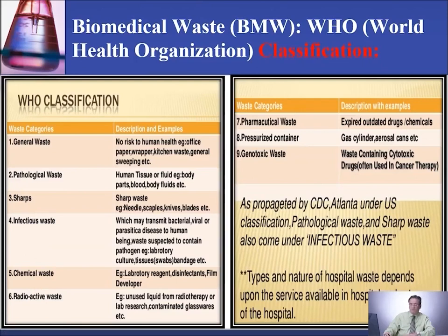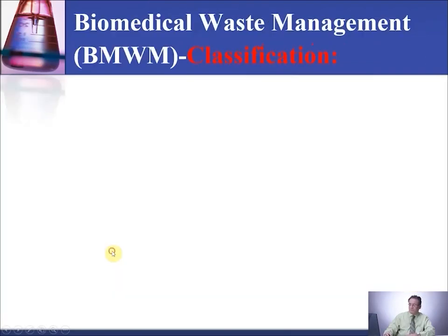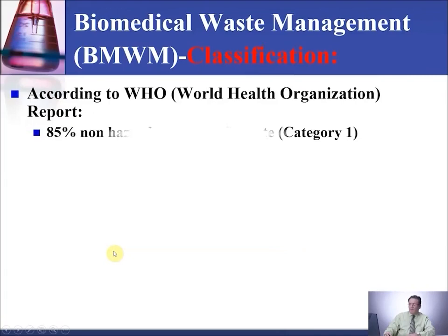You can go back to that or refer to that. Or you're going to end up with biomedical waste under number 2, number 3, number 4, and maybe even number 5, okay, or 8 and 9. Only a very tiny, small number of labs could have radioactive waste.